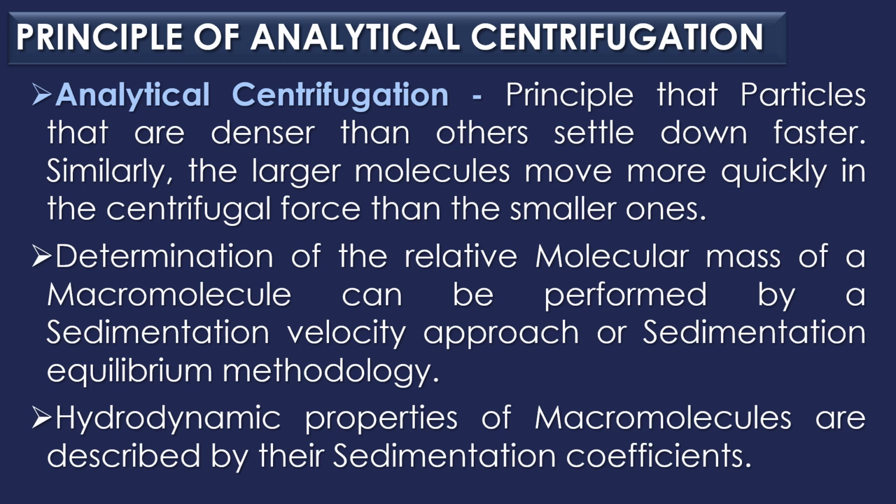Analytical ultracentrifugation for the determination of the relative molecular mass of a macromolecule can be performed by sedimentation velocity approach or sedimentation equilibrium methodology. The hydrodynamic properties of macromolecules are described by the sedimentation coefficients. They can be determined from the rate that a concentration boundary of the particular biomolecules moves in the gravitational field.